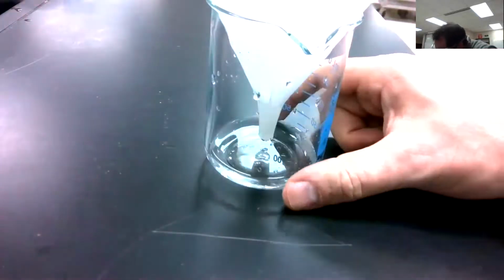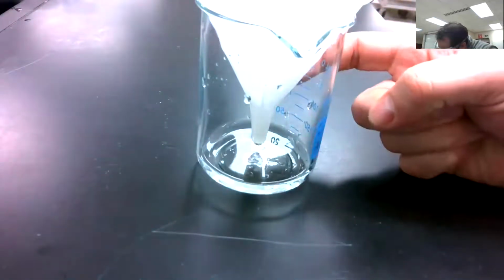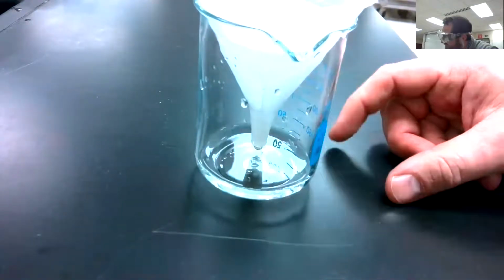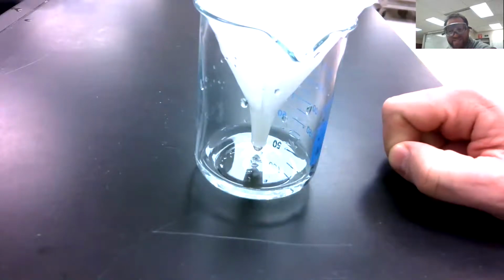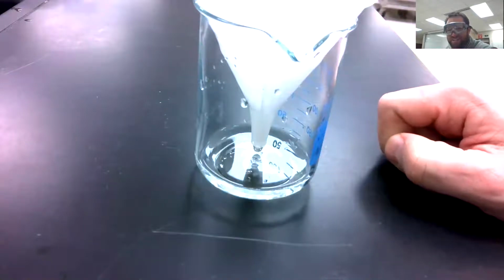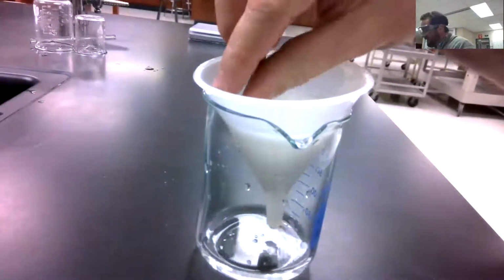Is that one more? Can I help that guy out? He's hanging in there. One last little drop. All right, we're going to call that a day. I'm going to go ahead and pull the filter paper out here, carefully.